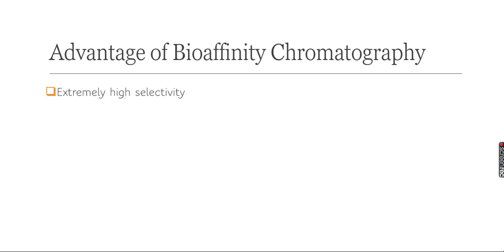Now what are the advantages of bioaffinity chromatography? It is extremely selective in nature. So we know specifically what kind of molecule is going to bind, and that affinity can be very specific, either at the group level or even at the specific molecule level. There is good purification and more than 90% recovery in a single step. So the degree of purification in a single step is quite high, which is very attractive and advantageous for bioaffinity chromatographic systems.